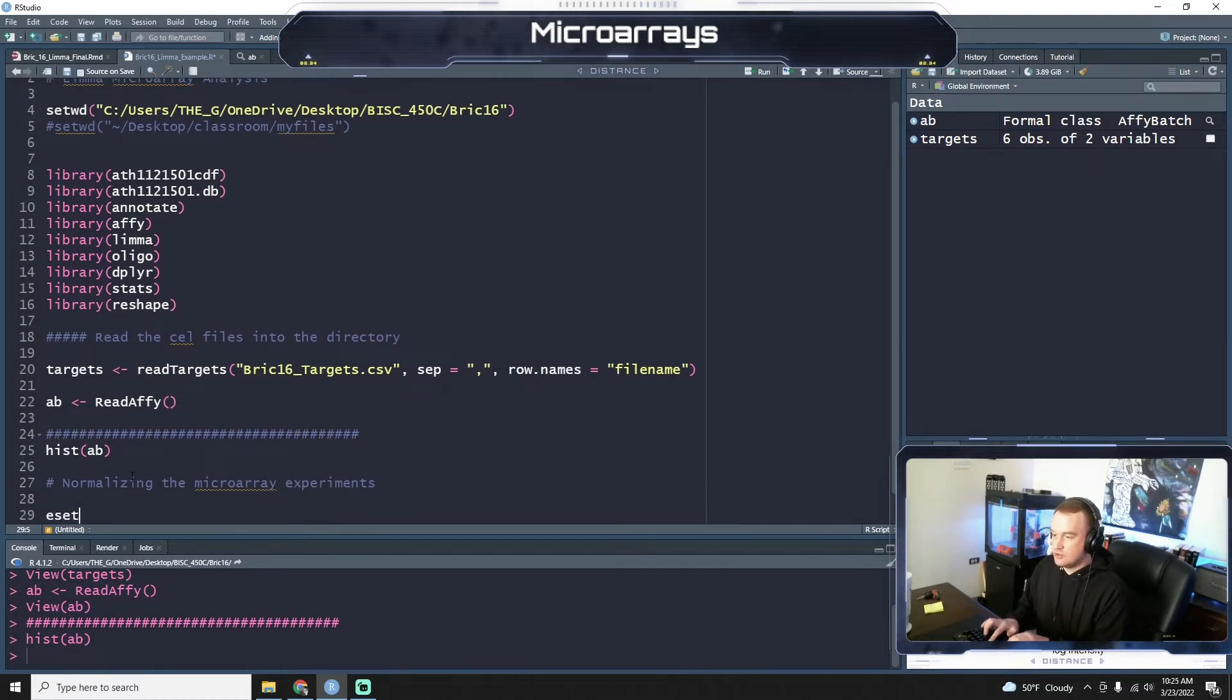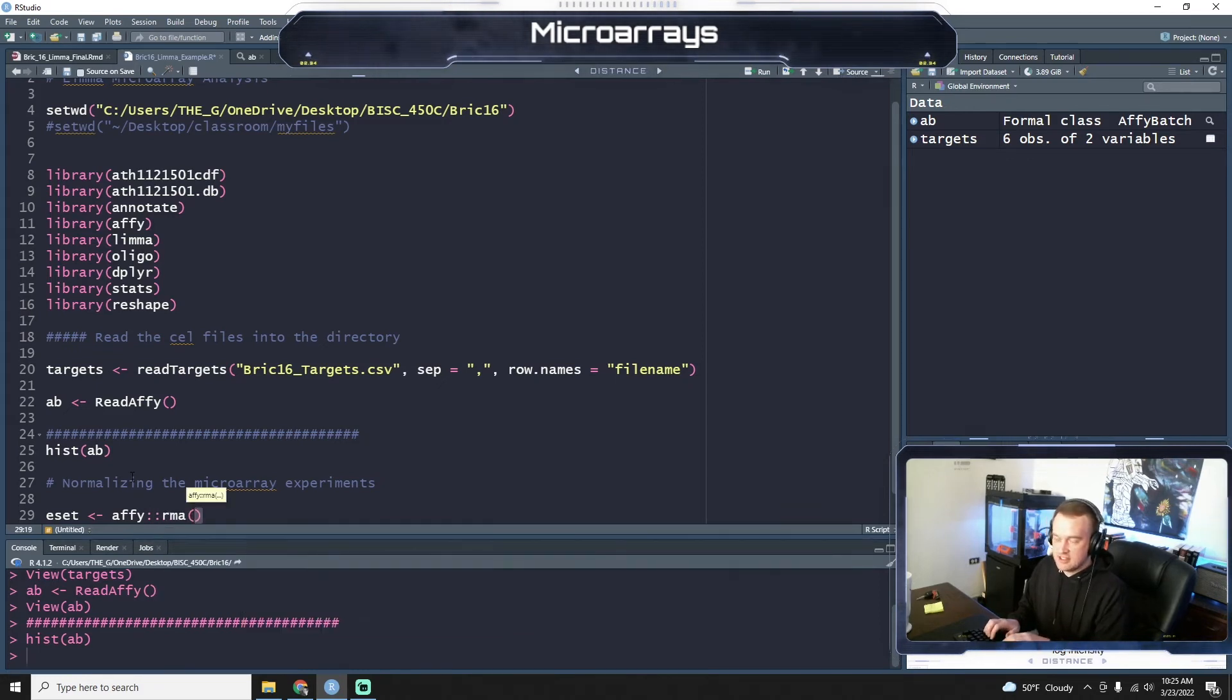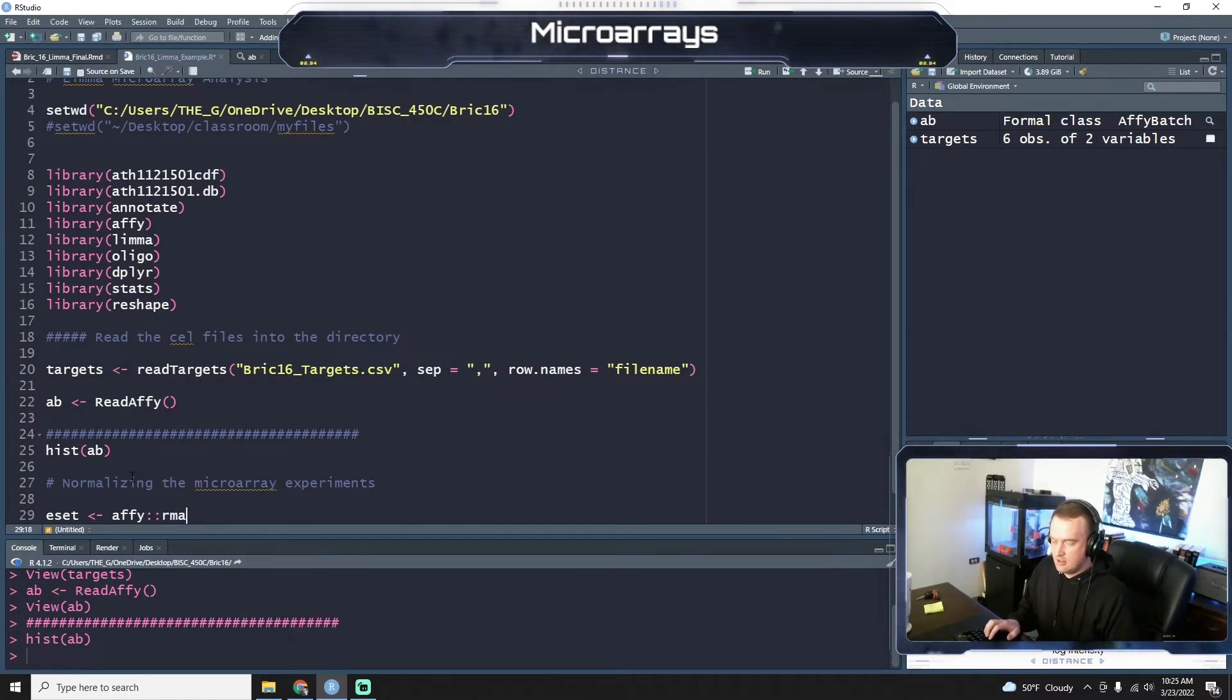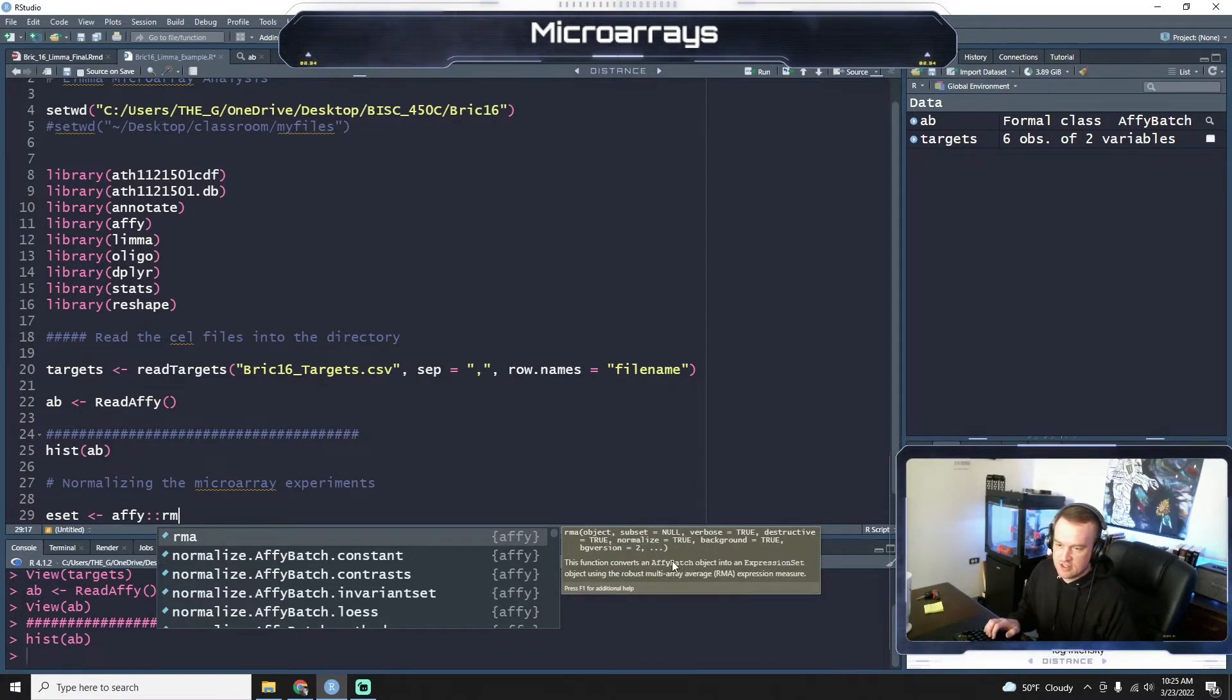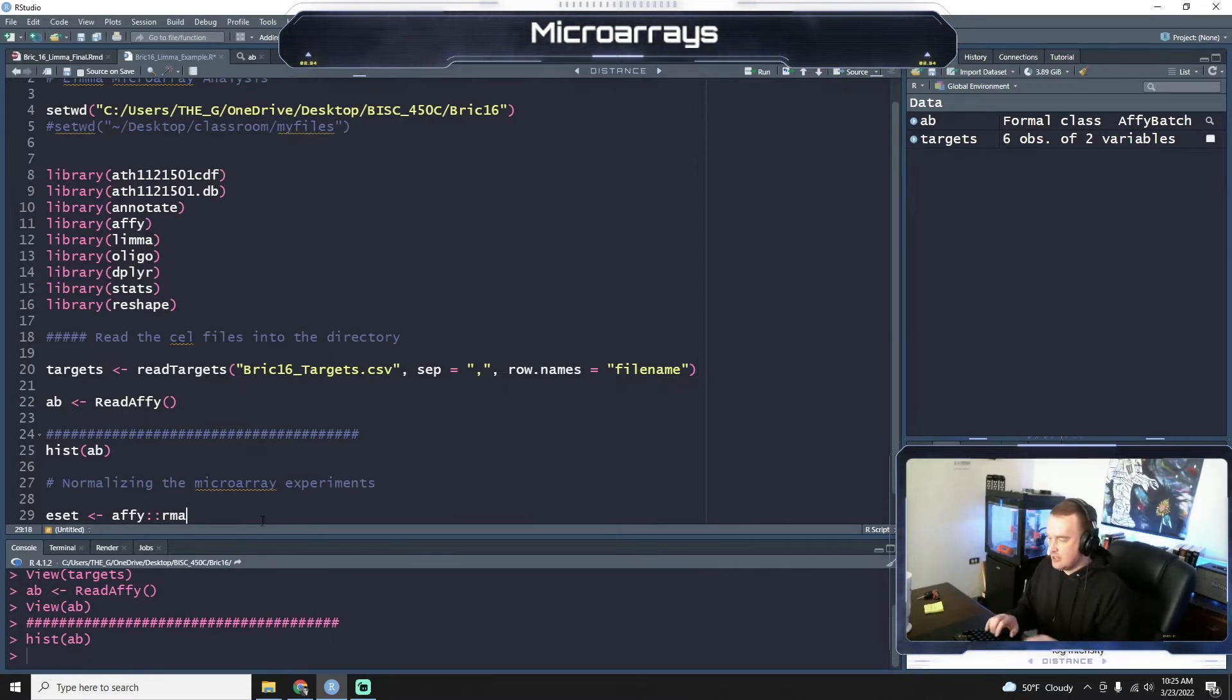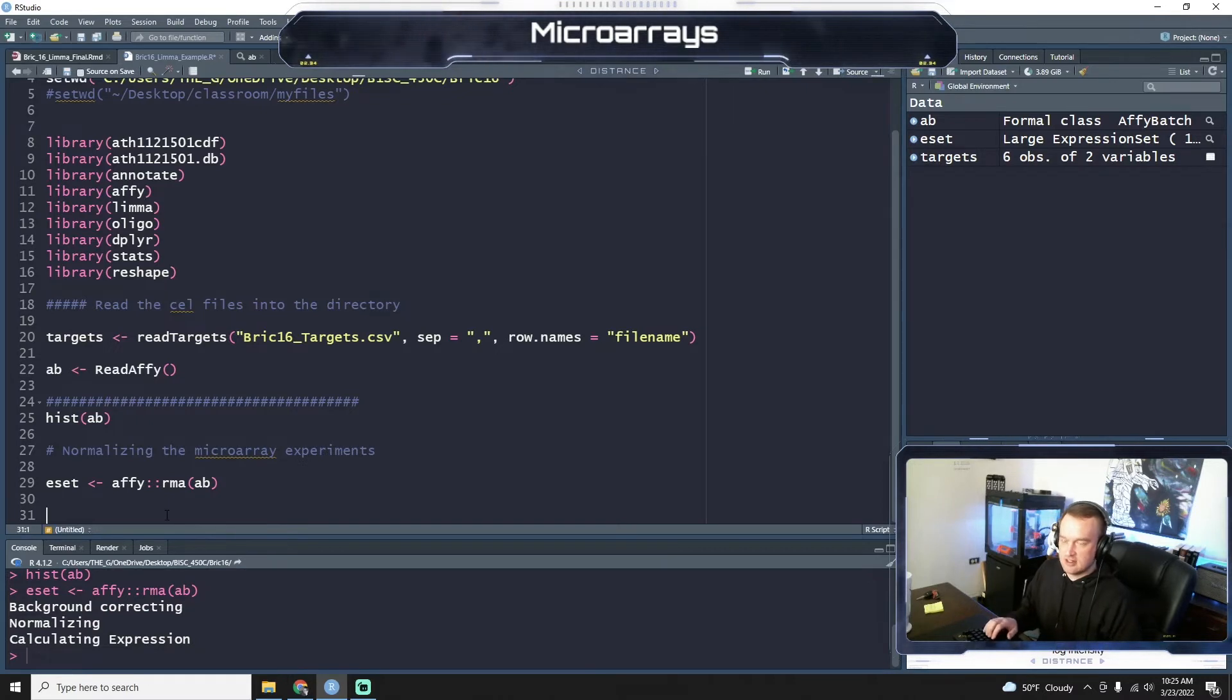So what we have to do is we have to normalize the microarray experiments. Right. So we're going to normalize the microarray experiments. So we'll do this, a new variable called ESET, which stands for expression set. And we'll use the affy package and RMA, which is a function that converts an AffyBatch object to an expression object using the robust multiarray average expression measure. So it's a way to normalize these. And we'll see how that looks in a second here. So we're going to run this. So it's background correcting, normalizing, and calculating the expression.